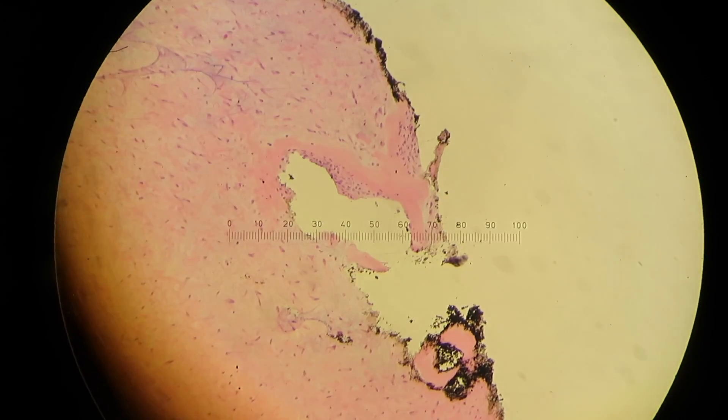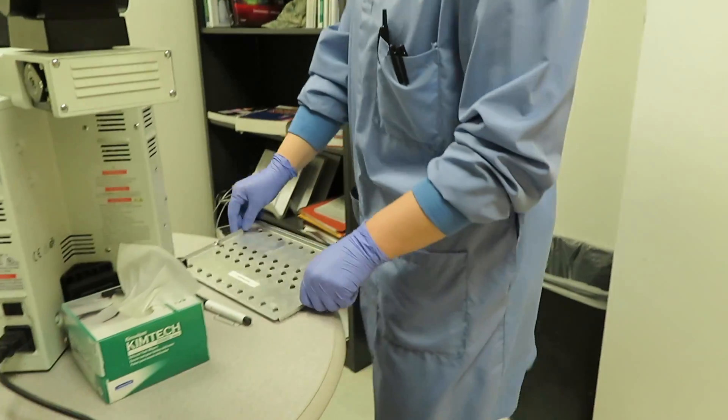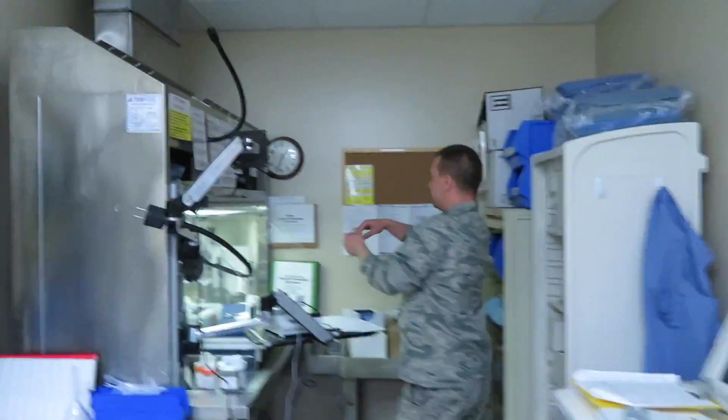We'll do a bread-loaf cut and see if there's anything else. I don't see anything exciting here at all. She's bringing in another level, but I think we're going to have to go back in and get some other sections. This one doesn't show anything really bad, which is good for the patient, but we want a good representative sample. All it was is just mostly benign fibrous-type tissue.